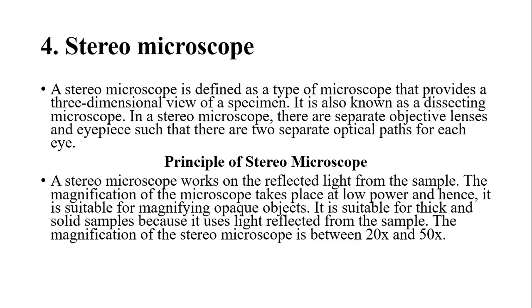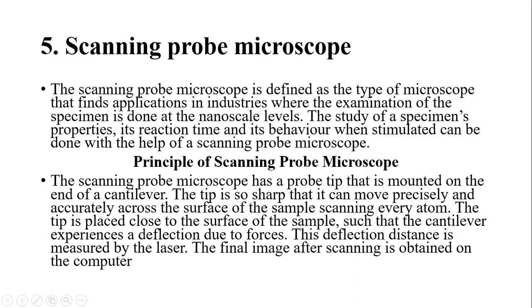Okay, that is self-explanatory. A stereo microscope is also known as a dissecting microscope, and as Vivian has taken us through well, you will read on your own. Let's go to the fifth microscope, the scanning probe microscope. Priscilla, please take us through the slide on the screen.